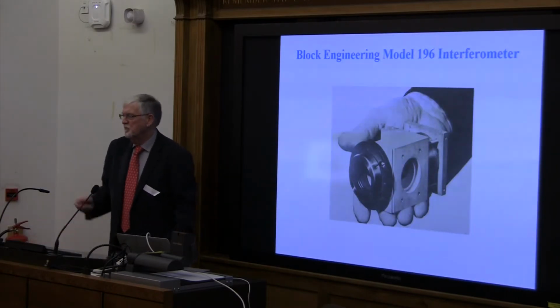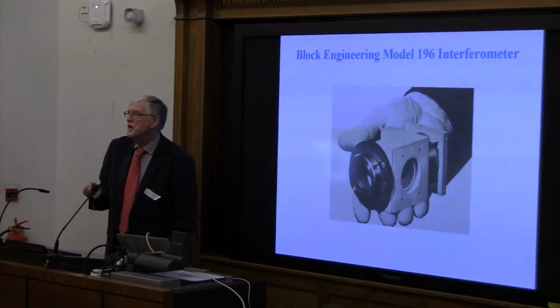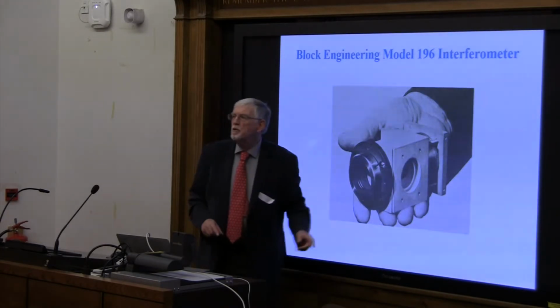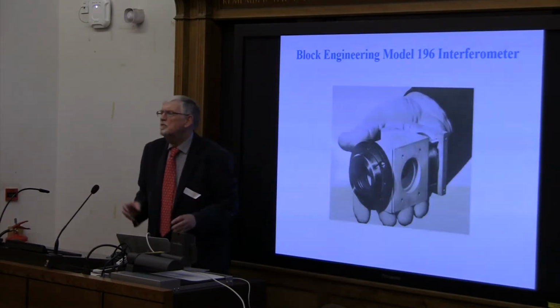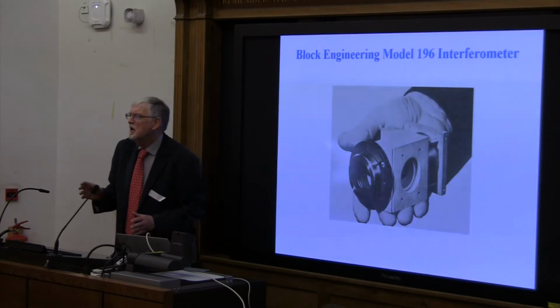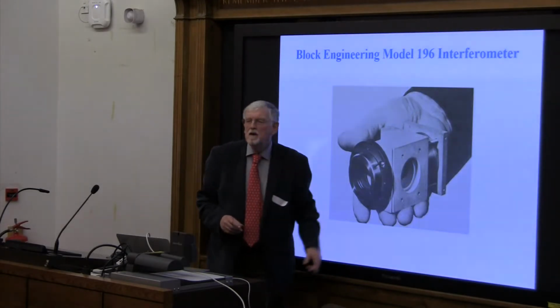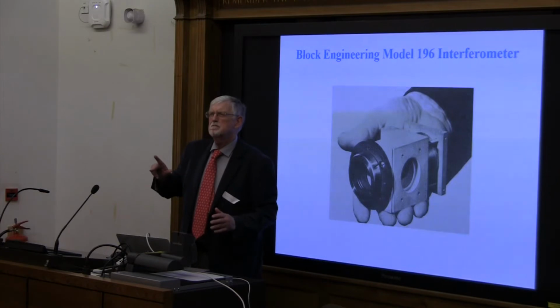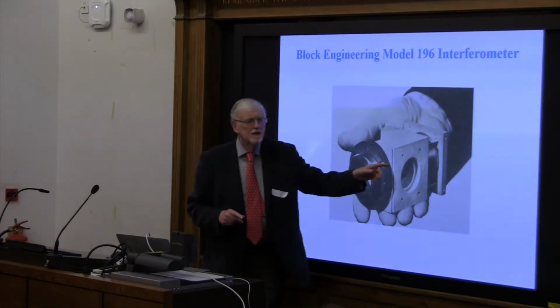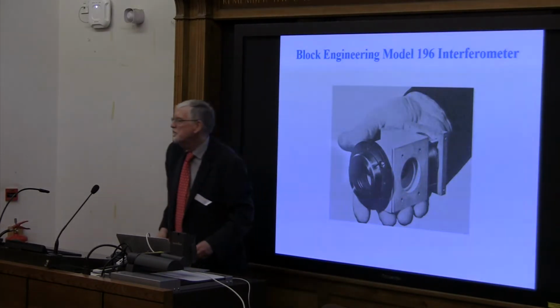This was one of these instruments. It was small, it was portable. Its beam splitter was about 1 centimeter across. Its drive here was a standard voice coil drive, typical of what's used today, the sort of drive that you'll find in the woofer of an amplifier now. And so as you increase the current through the coil, the Faraday's left or right hand rule drove the mirror through a magnet, and the mirror then moved back and forwards across here.